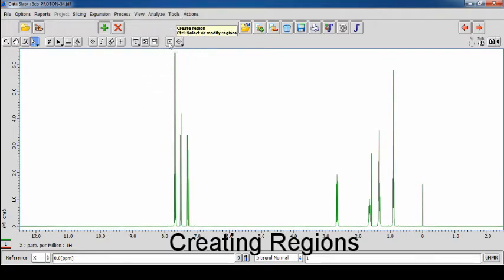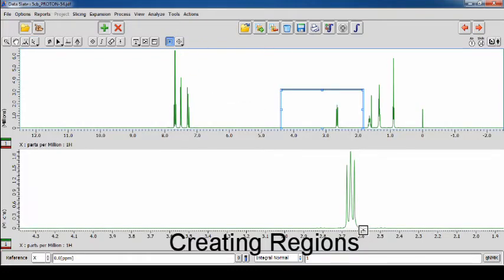Create Region performs a similar function to PIP, but creates a second geometry instance instead of a window. Anything which affects the region also affects the geometry.